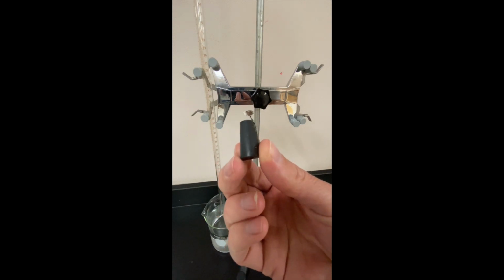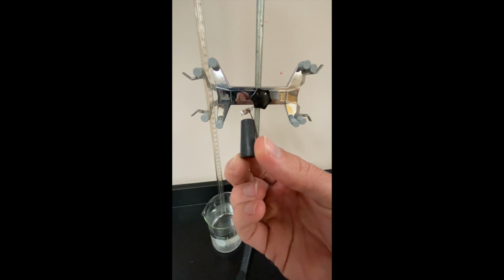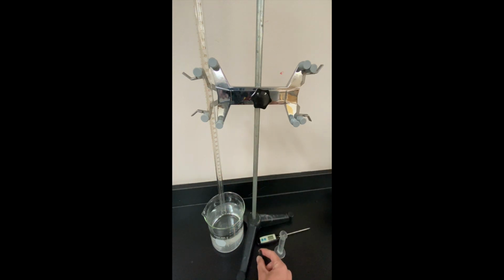piece of copper holding some magnesium ribbon, and then we have a eudiometer that will be submerged in water to collect the gas underwater. The reaction that's going to be taking place is the hydrochloric acid with the magnesium to produce hydrogen gas. So we'll be collecting hydrogen gas and then calculating how many molecules are in that sample of gas. So what you're seeing right now is the eudiometer.